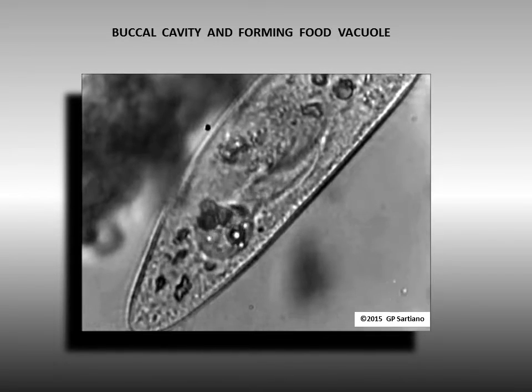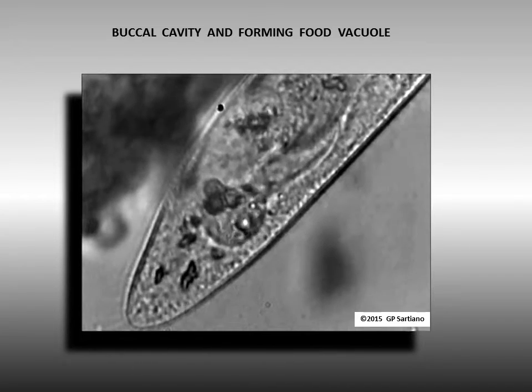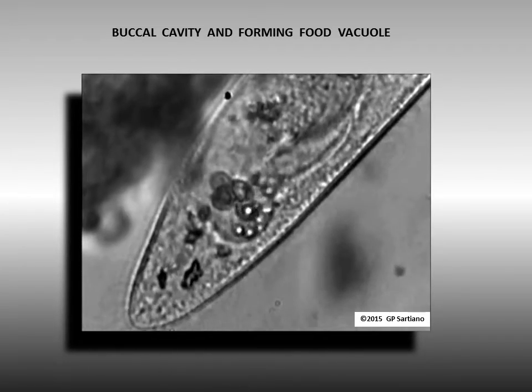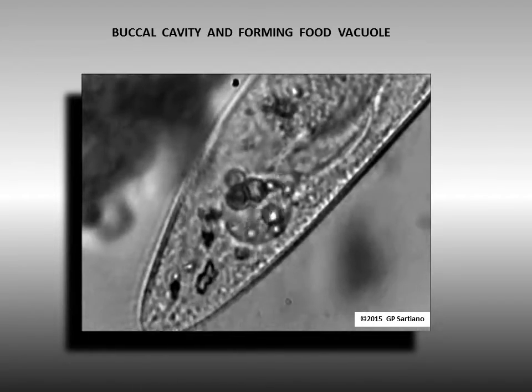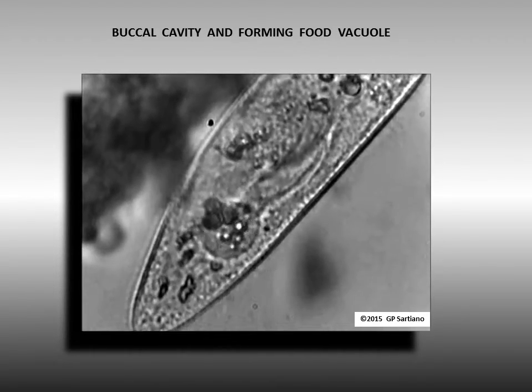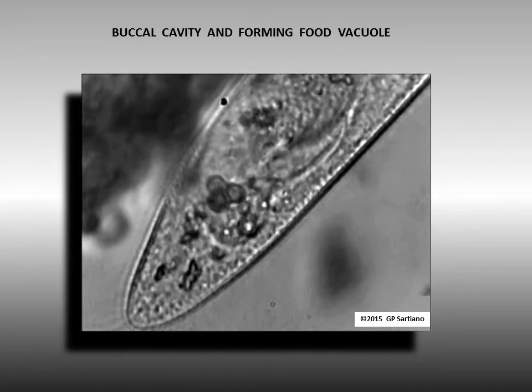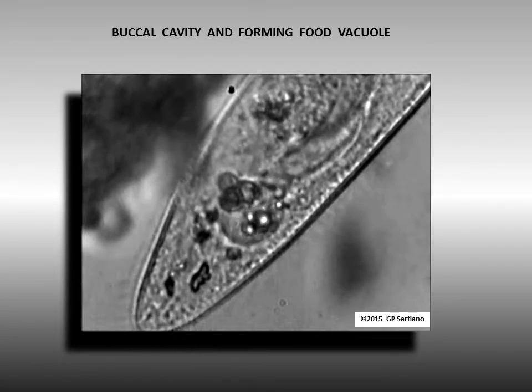Note that the particles which have been swept into the postpharyngeal sac by the action of the pharyngeal cilia are in continuous circular motion. Eventually, the sac will be filled and pinched off as a cytoplasmic food vacuole.